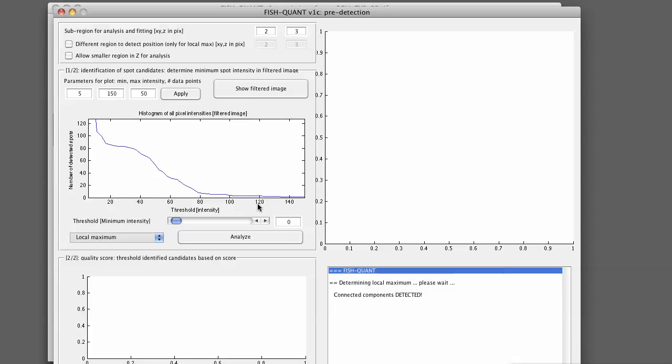This plot has this characteristic shape. The higher intensity threshold, the fewer spots are detected. If you get to a range in intensity where you get a good detection, you see a small plateau and then it really goes up for lower intensities.